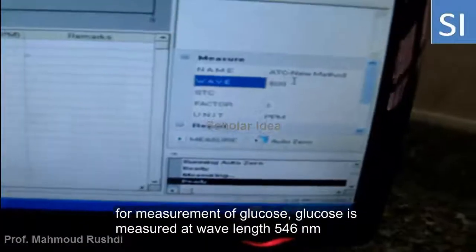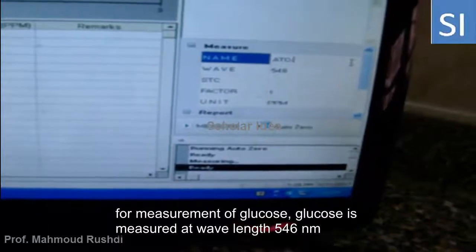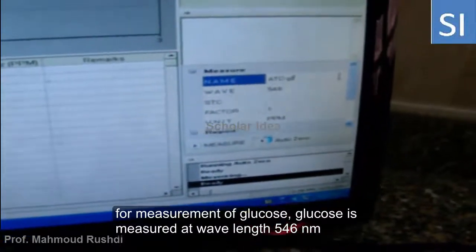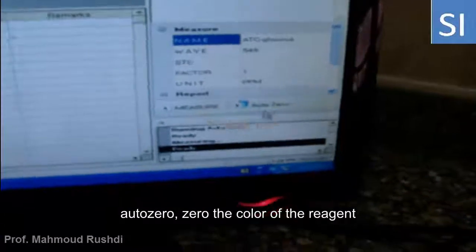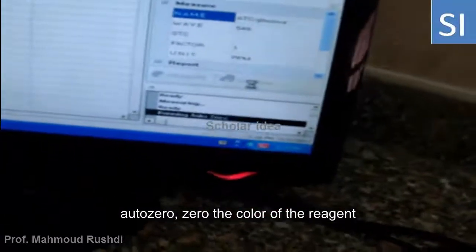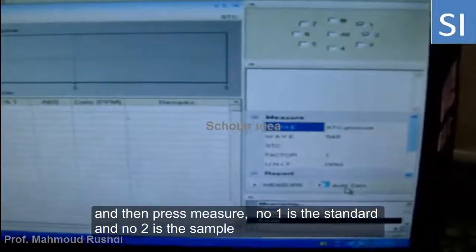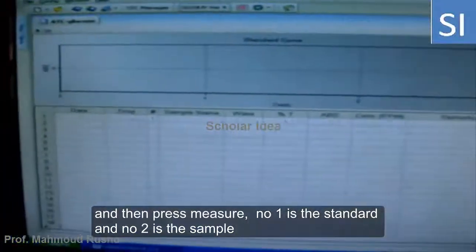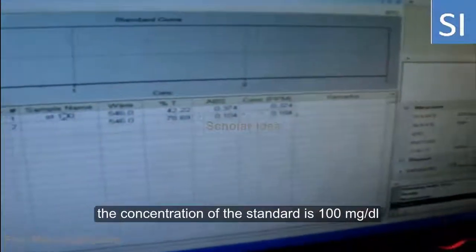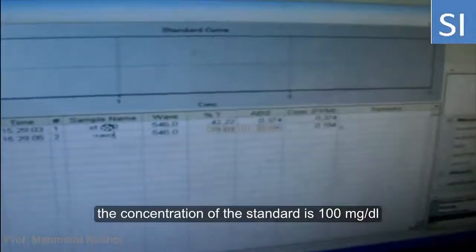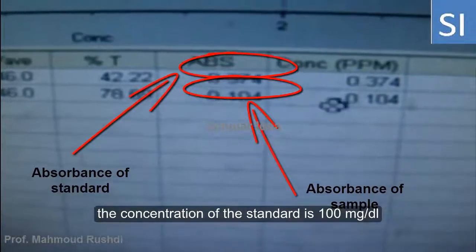Adjust the spectrophotometer to measure glucose at 546 nm. First, zero the instrument using the blank cuvette — the blank contains only the reagent, so zeroing removes its background color. Then measure cuvette number one, which is the standard, and cuvette number two, which is the sample. The standard has a known concentration of 100 milligrams per deciliter, and the absorbance of the standard is higher than the absorbance of the sample.